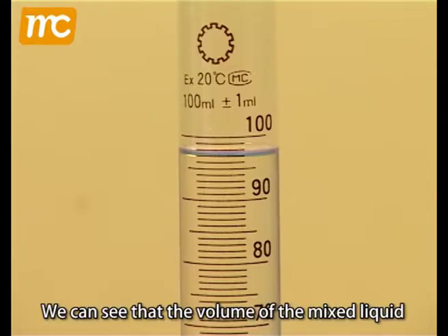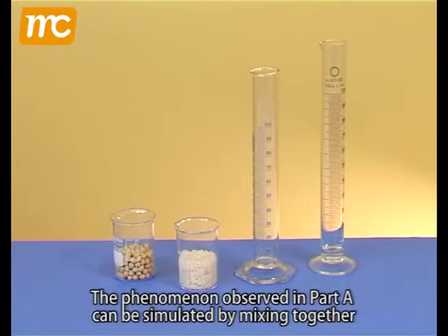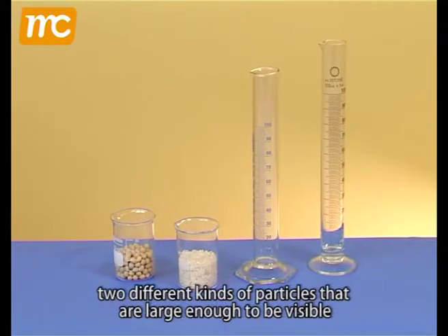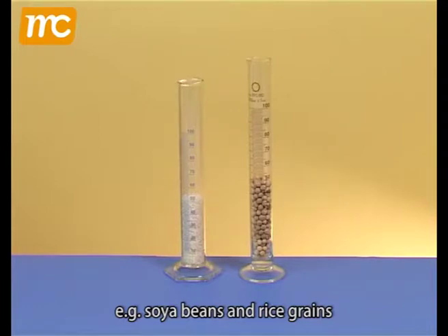We can see that the volume of the mixed liquid is smaller than the sum of the volumes of the two liquids. The phenomenon observed in part A can be simulated by mixing together two different kinds of particles that are large enough to be visible. For example, soybeans and rice grains.